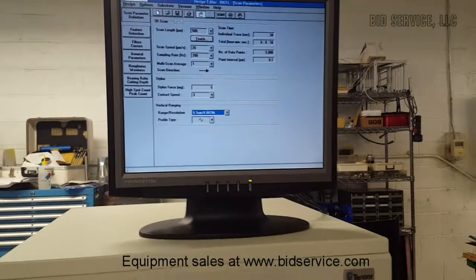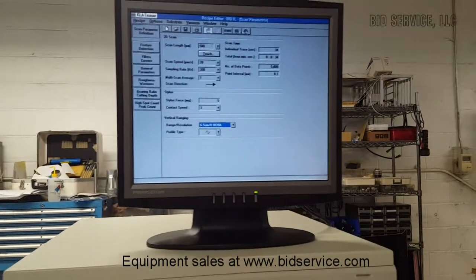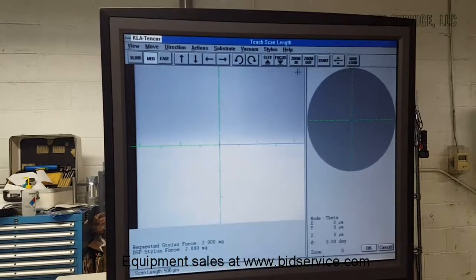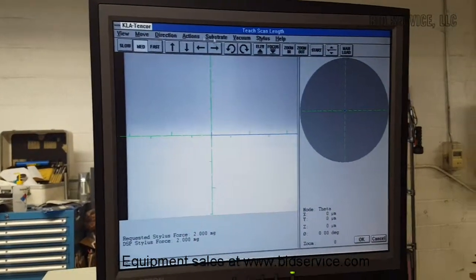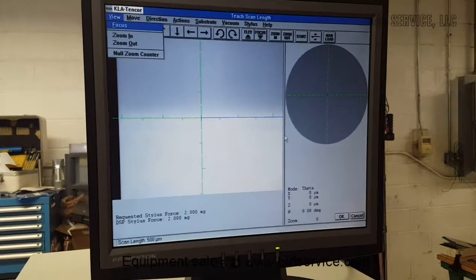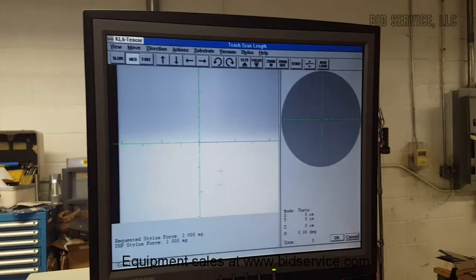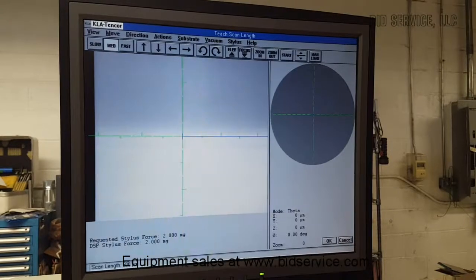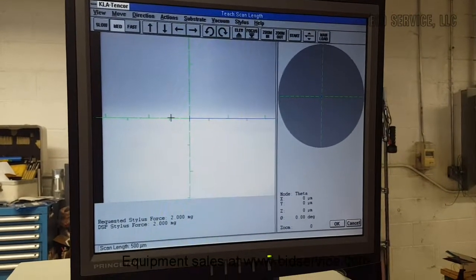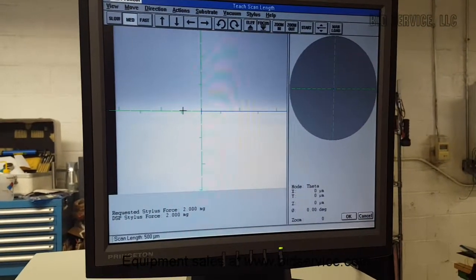So, there are other buttons here. This is the data view, or we can go back to the XY or theta view. This one displays the actual operation screen and the sample surface. The video signal is overlaid on the graphics of the system, and the video board used is Creative Technology CT6042.